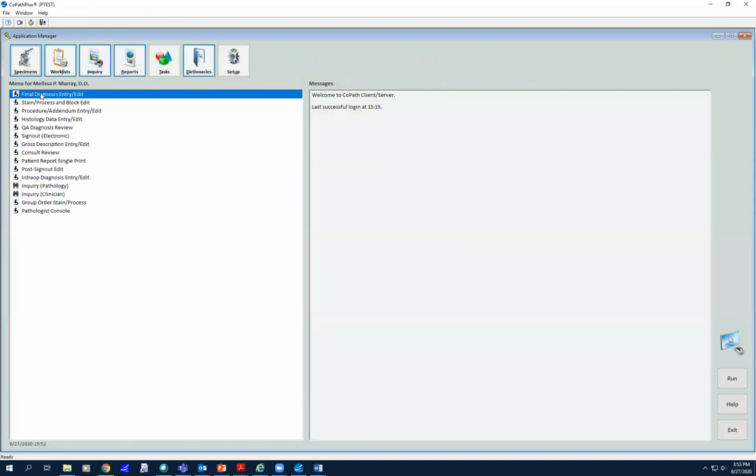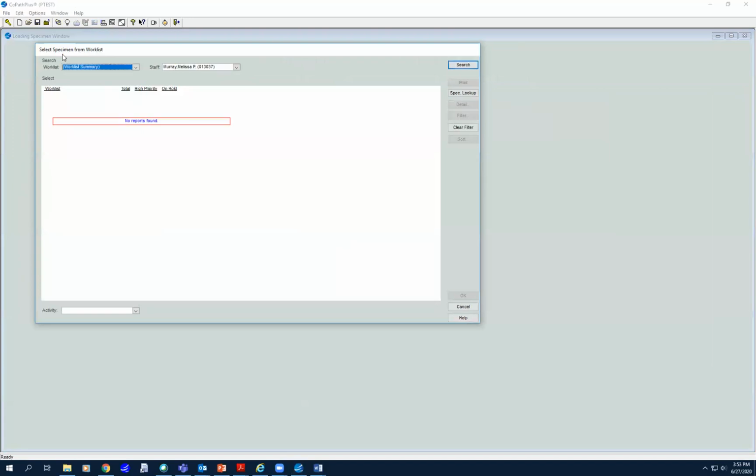Okay. Another couple things I want to show you. This is the button that will show you your work list. Since I had saved that to the fellows work list, it's not showing up on my work list yet. Okay, and your work list will be the same. You'll have all the cases that you've prepared here with the notes on the side.